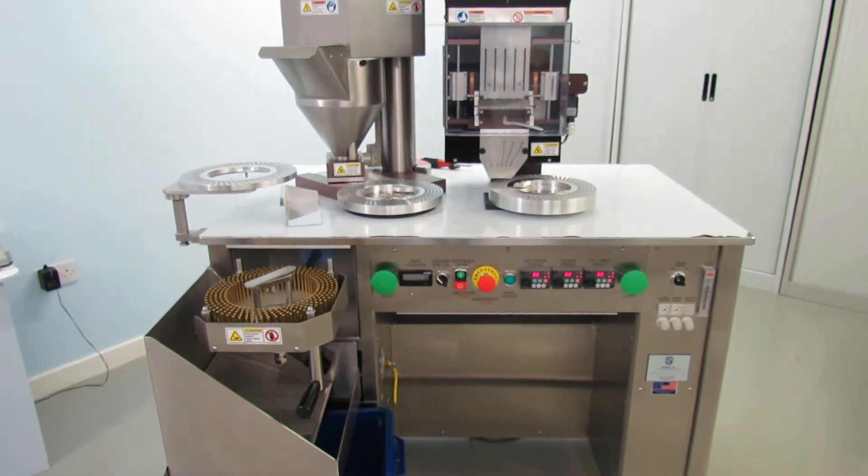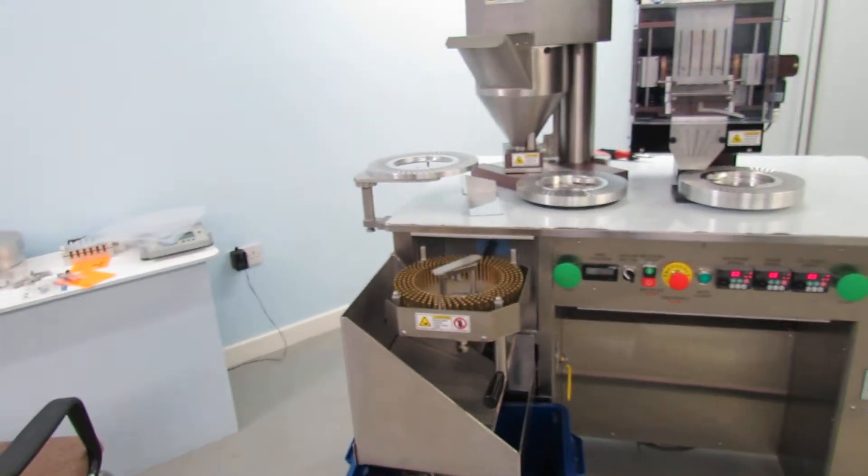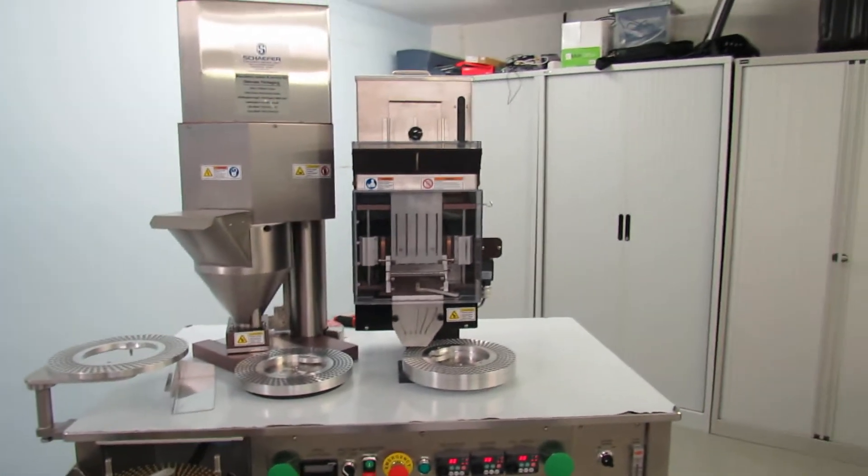As you can see we have the three stations: closing station, powder filling station, and the rectifier.